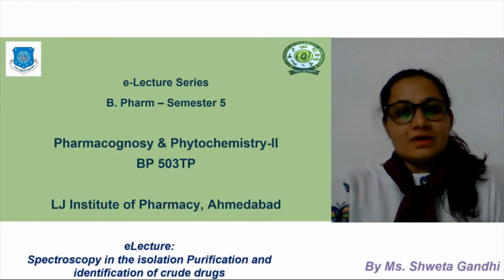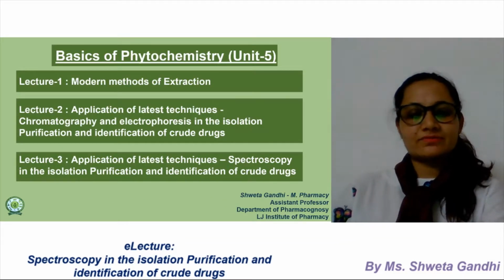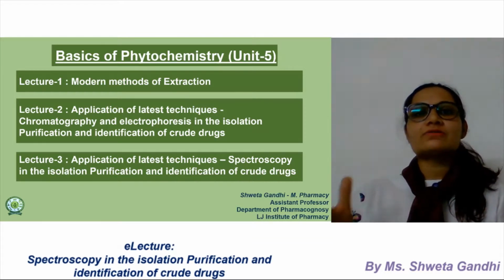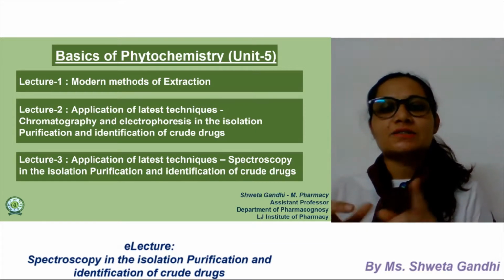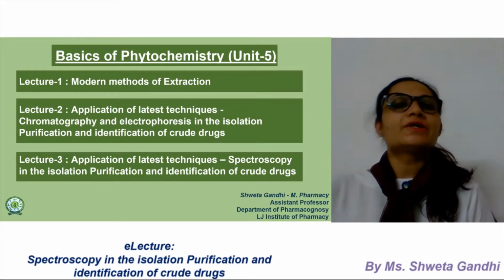Now, in this lecture, I will cover lecture number 3. The topic is application of the latest technique, that is spectroscopy, in the isolation and purification of the crude drug.